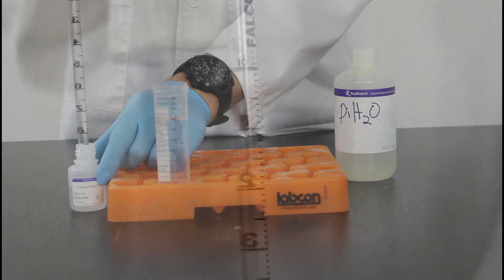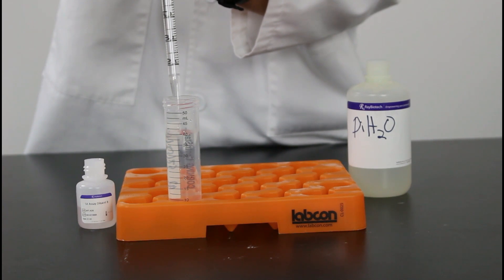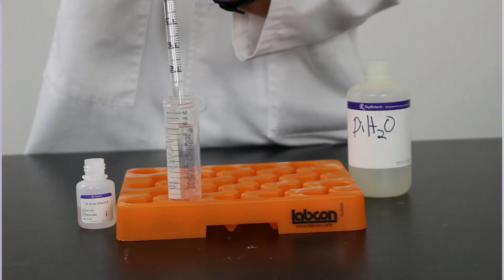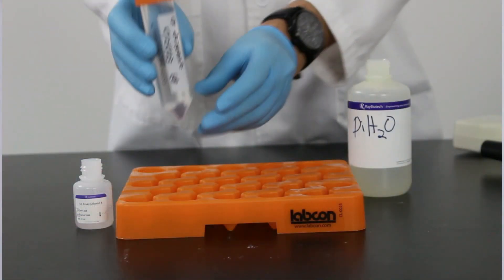Going back to Eric preparing that tube, he put in the deionized water first, and now he's pipetting in the 5x assay diluent buffer. Remember, it's always an important convention to label the tube with your dilution and concentration factors, as well as what's in it. If you share the lab with multiple people, you should put your initials on it, and if it's going to be in the fridge for a long time, you should put the date that you're using it and the expiration date.